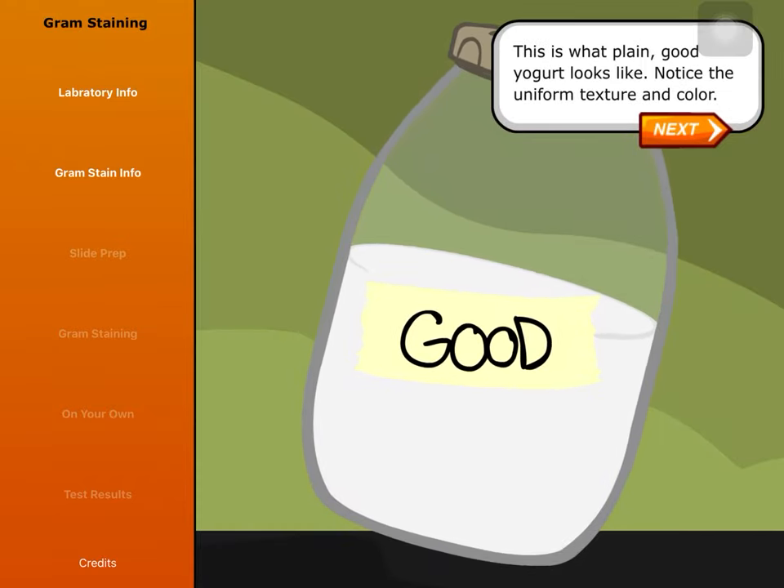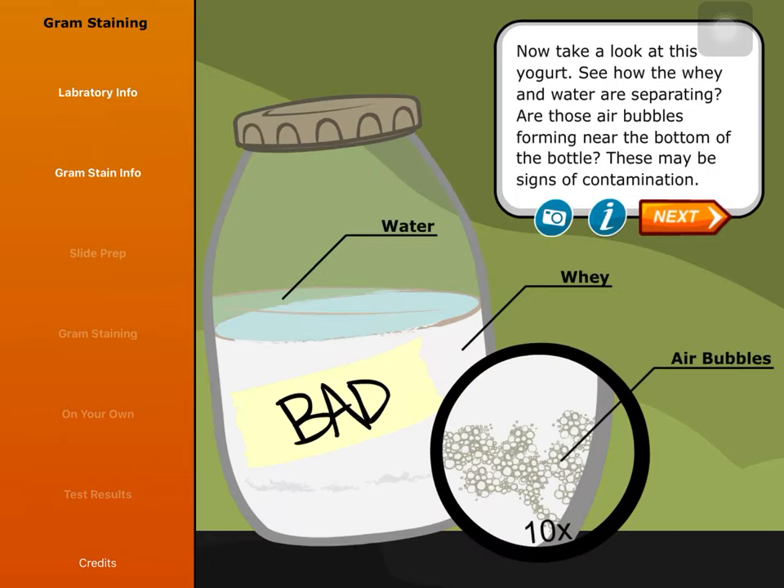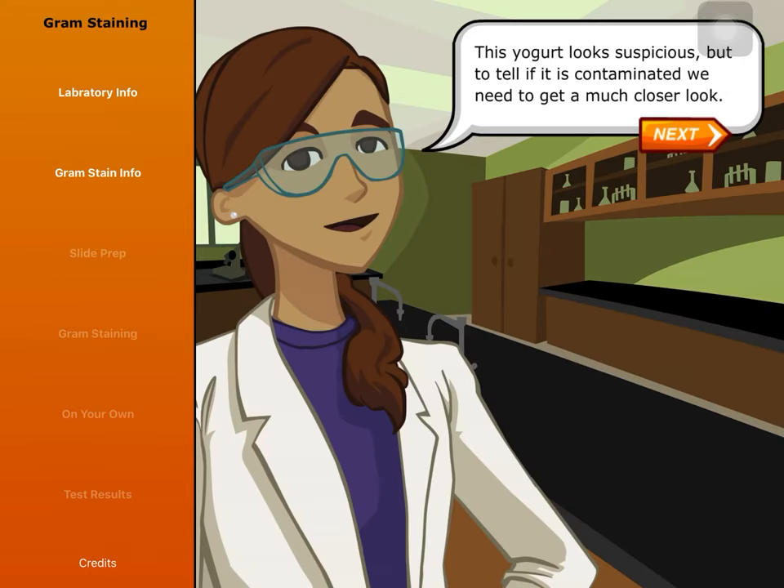This is what plain, good yogurt looks like. Notice the uniform texture and color. Now take a look at this yogurt. See how the whey and water are separating? Are those air bubbles forming near the bottom of the bottle? These may be signs of contamination. This yogurt looks suspicious, but to tell if it is contaminated, we need to get a much closer look.